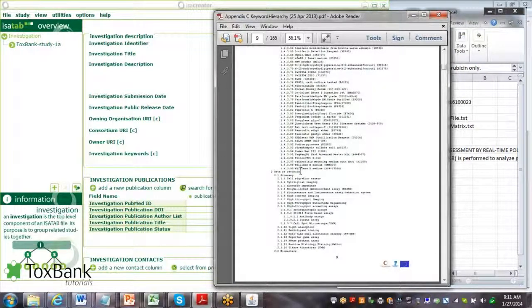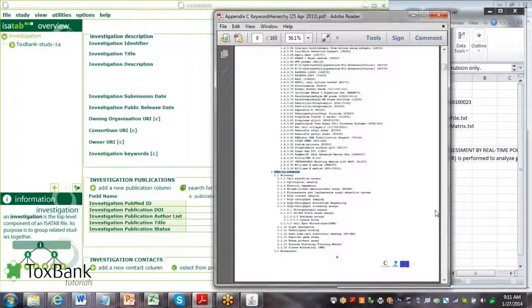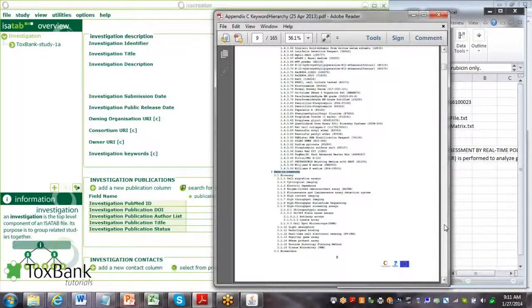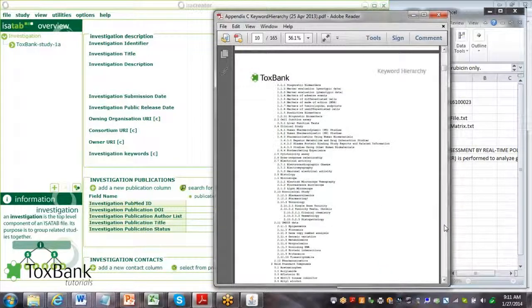The next is the type of data that's created or readouts, things like high-throughput screening assays, biomarkers.